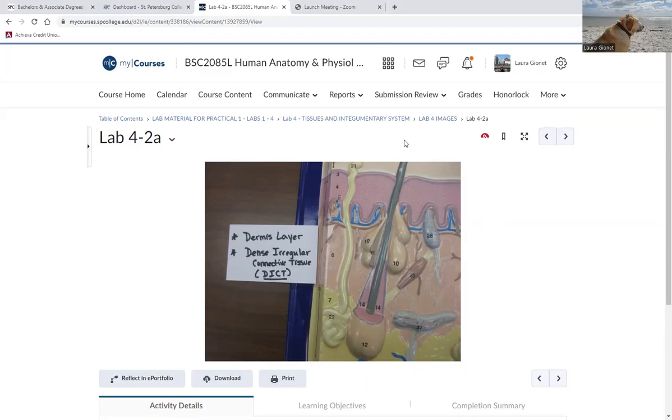To the right of that, you can see this brown, or I guess it looks gray here, shaft of something, that's hair. And these glands to the right and left, 10 and 11, are the oil glands or sebaceous glands that use the shaft of hair to secrete the oil onto the surface of your skin, thus oily hair.